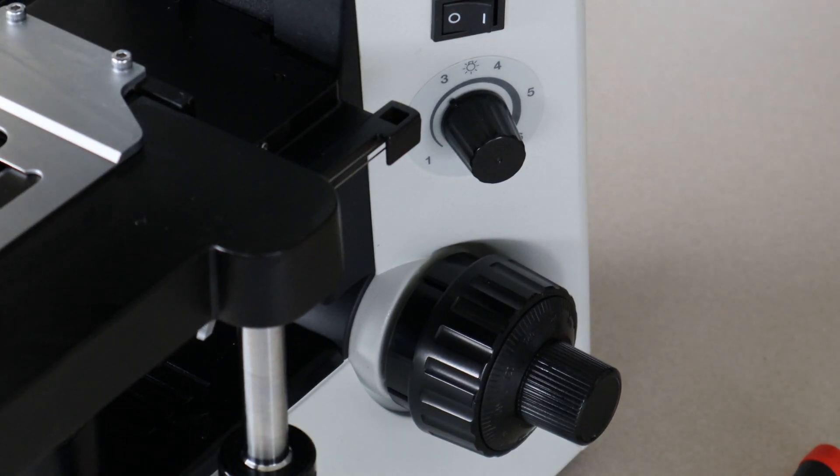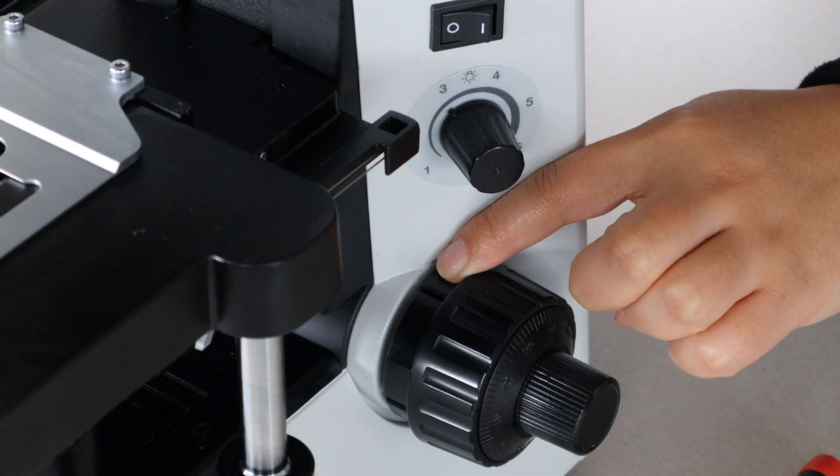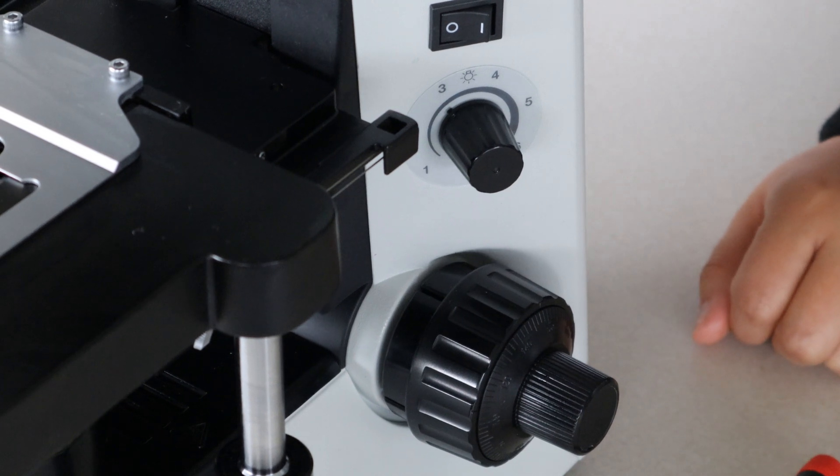All right, you'll see here we have your coarse focus, and just behind that is that black ring with the multiple slots in it, and that is going to be your tension adjustment.